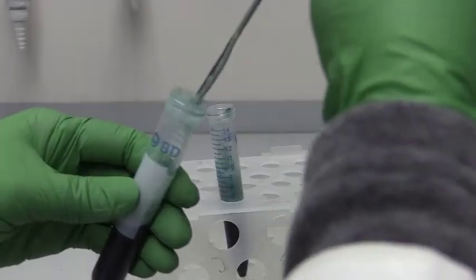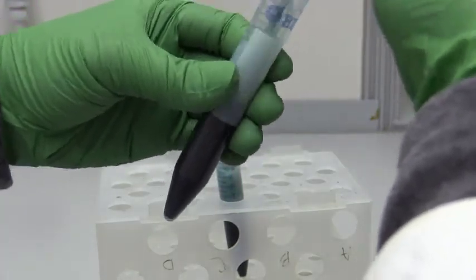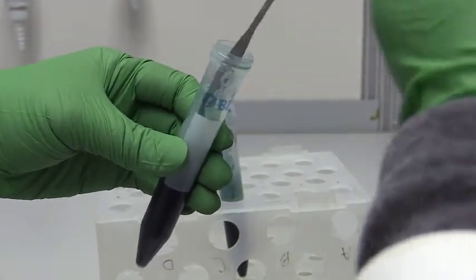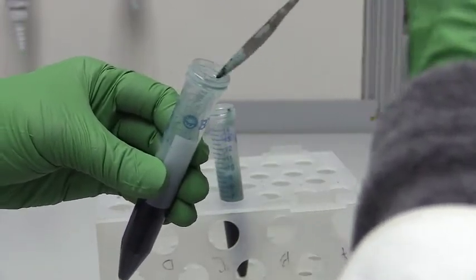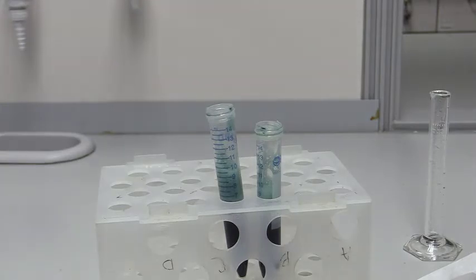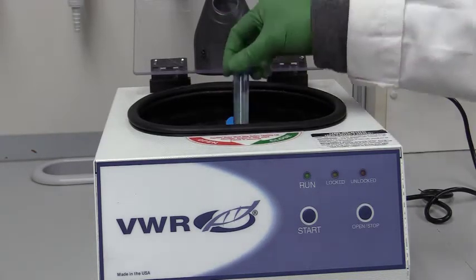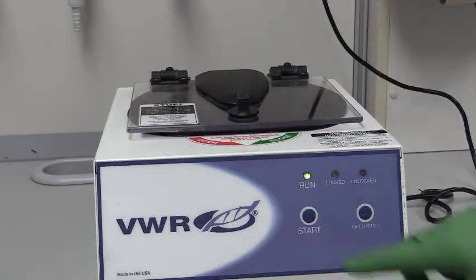the counter. And shaking it vigorously was not getting me anywhere, so I decided to use a spatula to stir it. So the spatula can get all the way into the end of the tips. That makes sure that all of the powder in the tubes is moistened and can be extracted. Next, it's important to centrifuge with balanced tubes. This was centrifuged for 3 minutes.